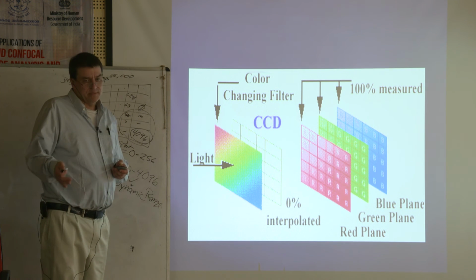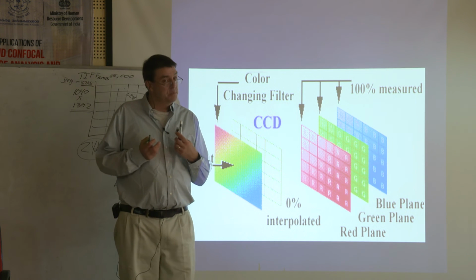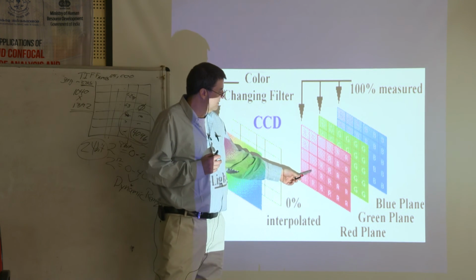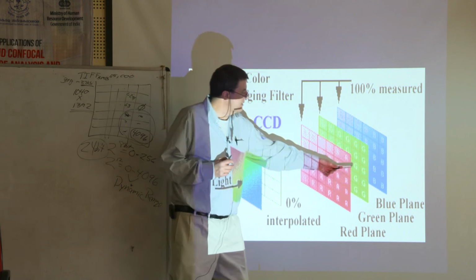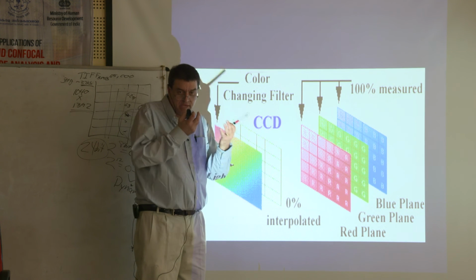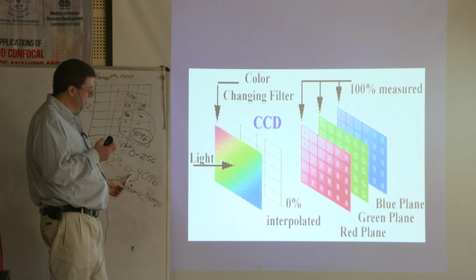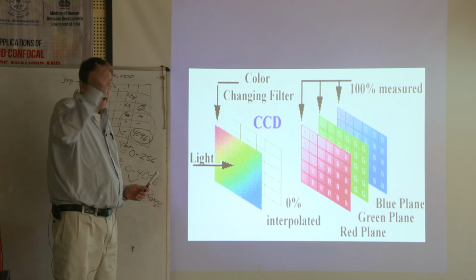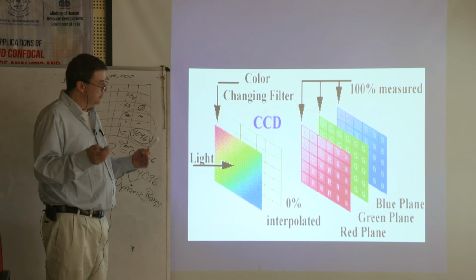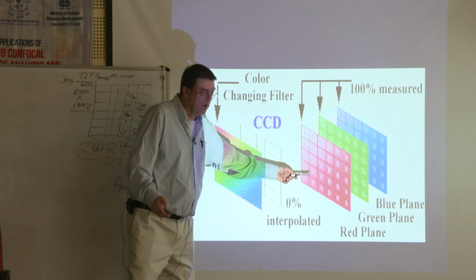The implications here for science are, if you bring me a color image to do analysis on, it is much more difficult for me to work with that because every pixel would have a red value, a green value, and a blue value. So I'd have to be able to tease out those numbers from three different channels to work with it, as opposed to a 12-bit image where it's either a number that's high or a number that's low. It's more like black and white. It's just much easier to work with. So if you're doing true quantitation, you're always going to work here. You really can't quantitate color.